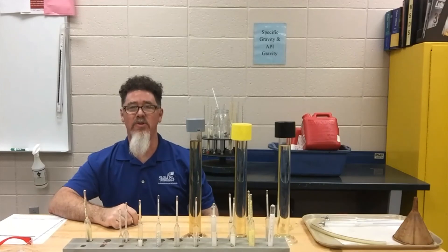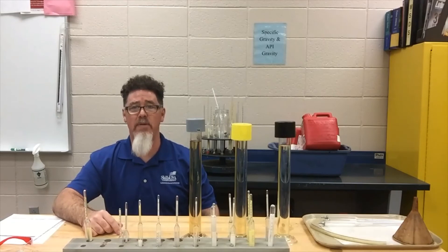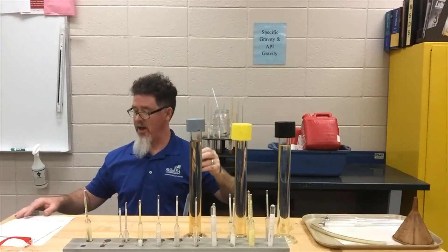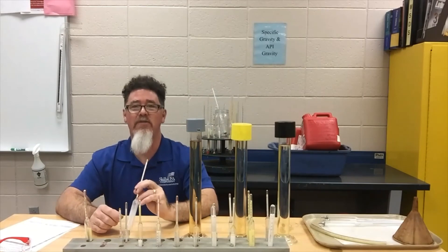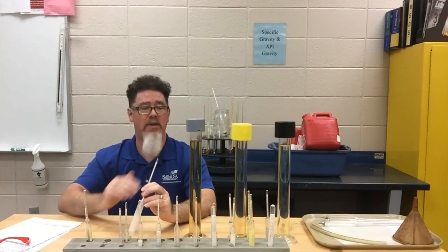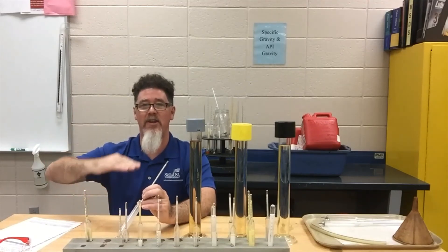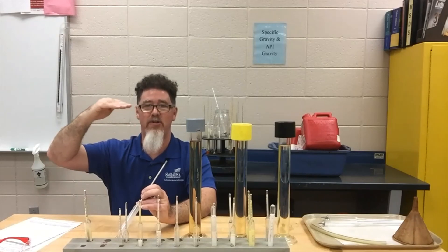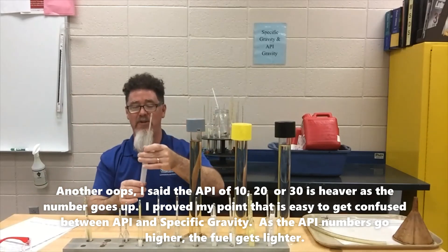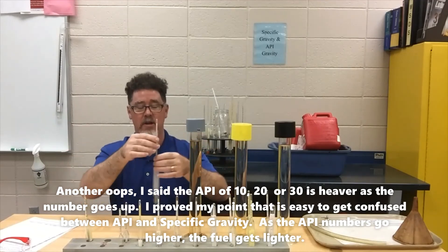Next we're going to check the API gravity. You may have a specific gravity hydrometer or an API hydrometer — the numbering systems are different between the two. With API, a gravity of 10 is water, so water is the heavy baseline at 10. As the fuel or oil gets lighter, the number goes higher — 20, 30, and so on. This is the opposite of specific gravity, which confuses most students.